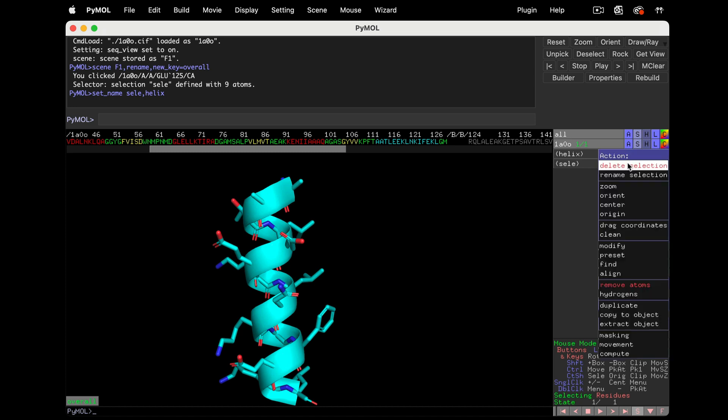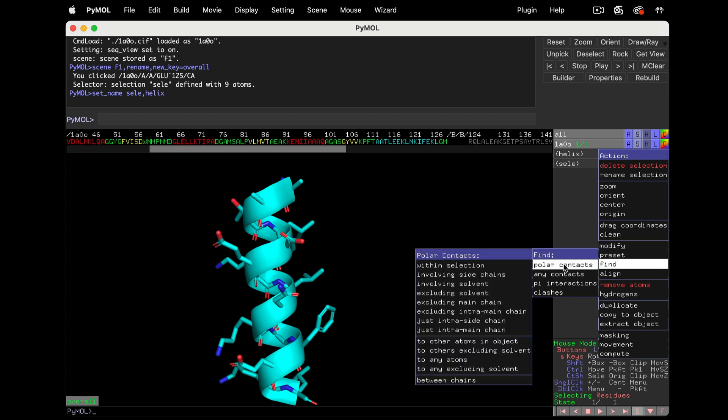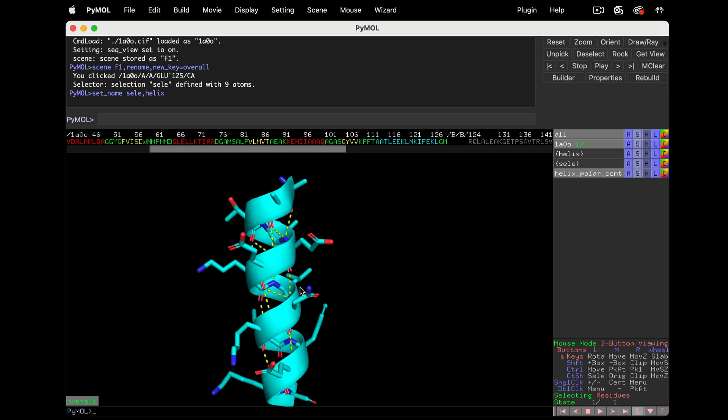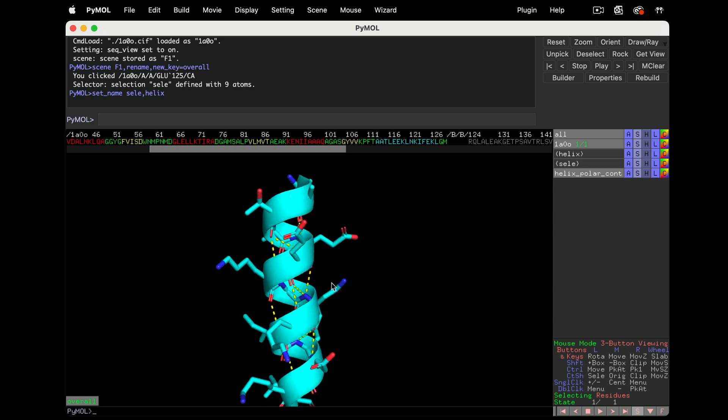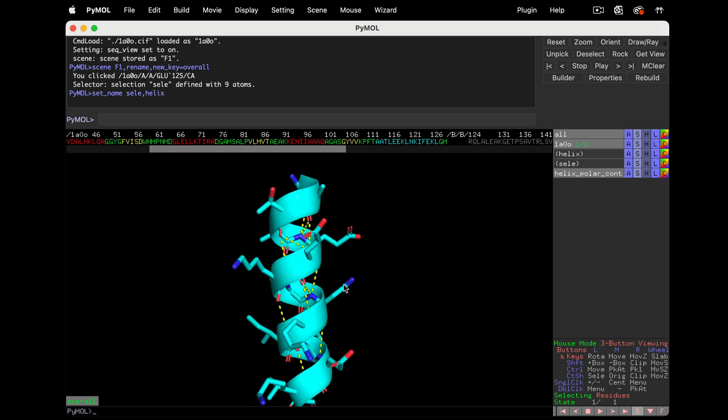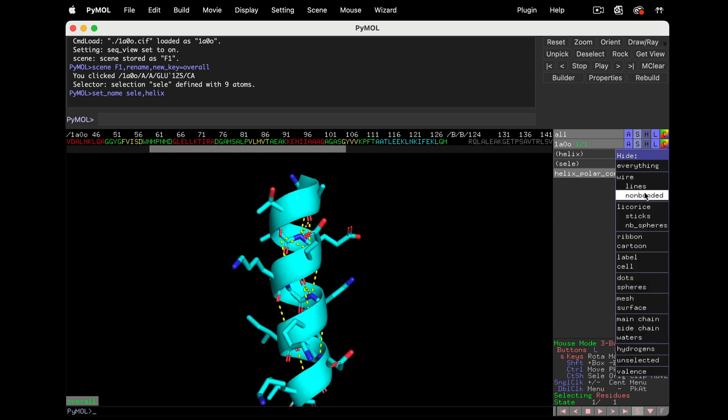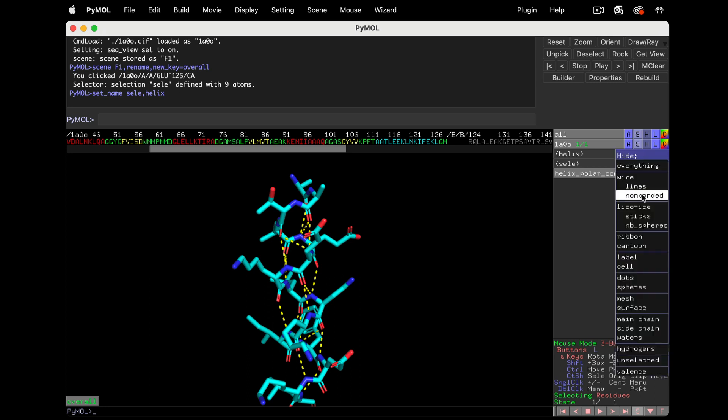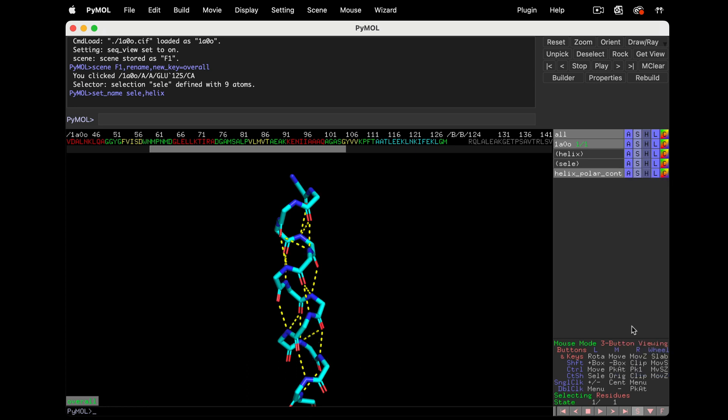Let's add these backbone-backbone interactions. Find Polar Contacts, Just Intra Main Chain. It's more than expected, but it's hard to see anything at all. Let's start by hiding the cartoon. Still pretty busy and overwhelming. Since it's only the main chain interactions we're looking for, let's also hide the amino acid side chains.